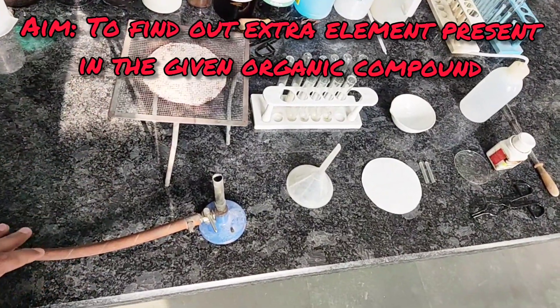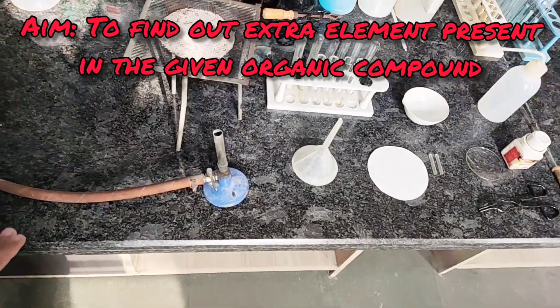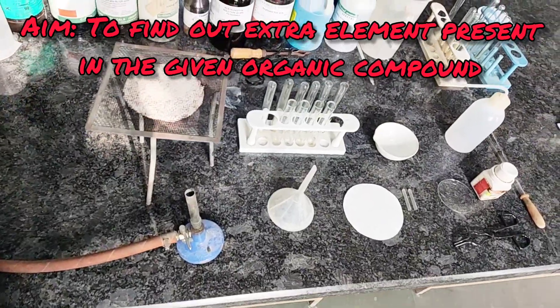With the help of Lassaigne Test, we can find out which extra element is present in a given organic compound.